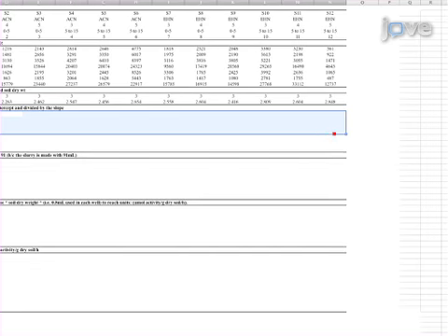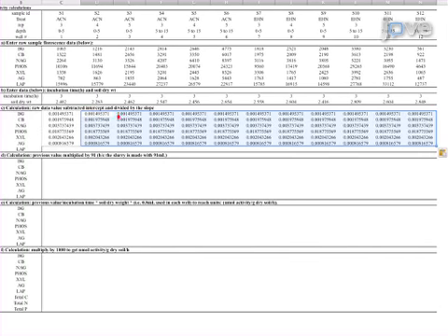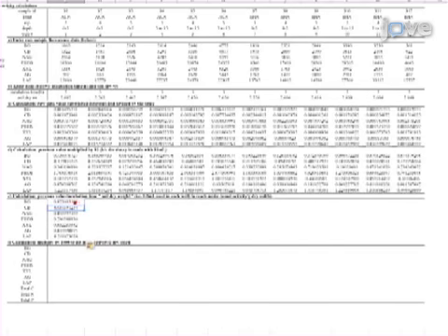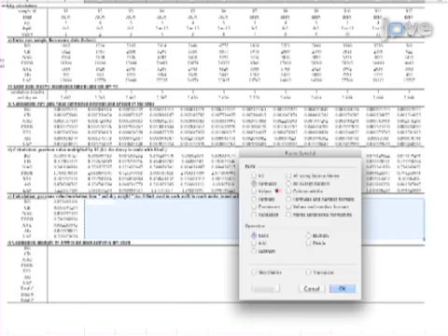Subtract the standard curve intercept values from the corresponding sample fluorescence values, and then divide by the slope of the corresponding standard curve using the standard line equation. Multiply the sample micromoles by 91 milliliters, which is the buffer volume used in the soil slurry. Divide the value obtained by the sample-specific incubation time and dry soil mass. Finally, multiply the value obtained by 1000 to get the desired units.